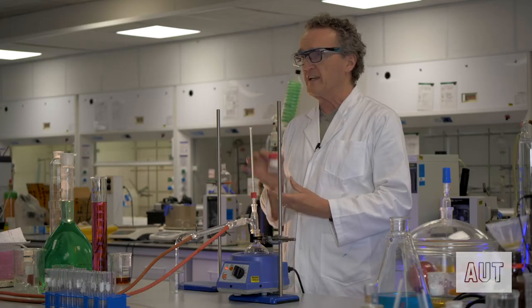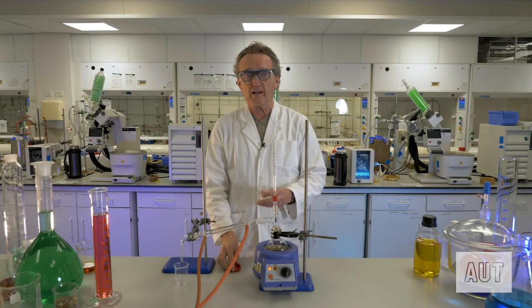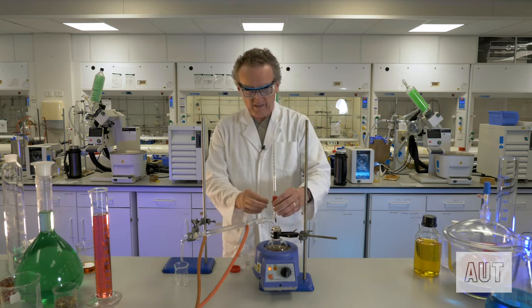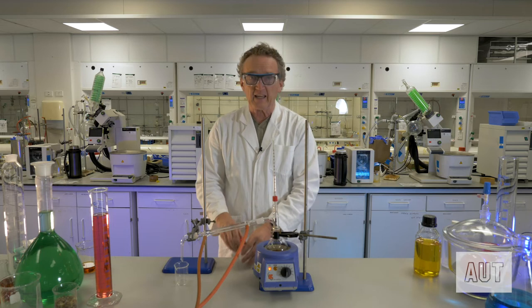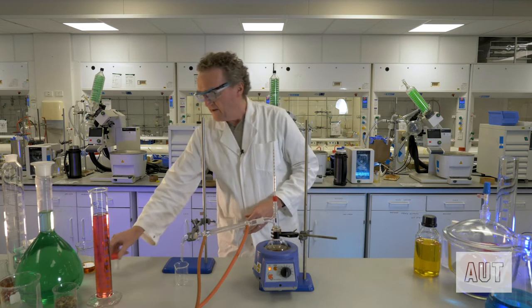The other thing not to forget, these are called anti-bumping granules, or in certain parts of the world, boiling chips. And you only need to put in a couple of them. And by a couple, I mean a couple. Don't go putting a whole handful in. Again, more is not necessarily better in this case.